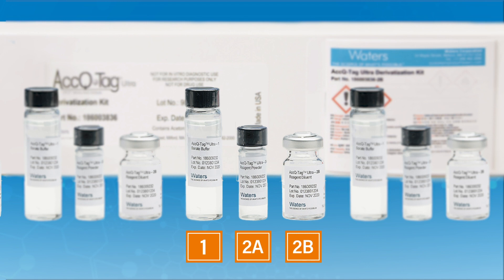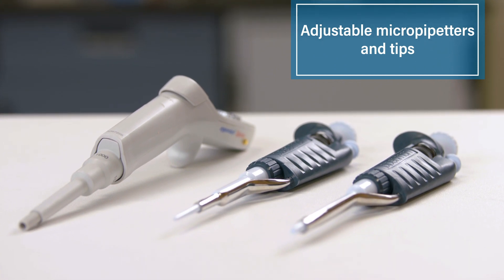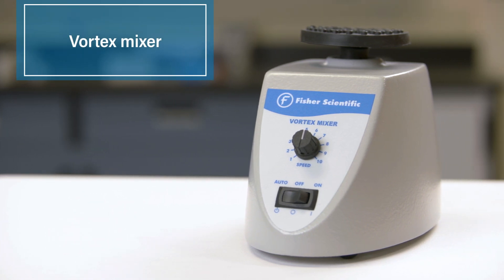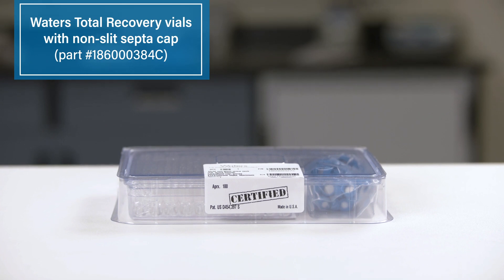Next, make sure you have the required equipment including adjustable micropipetters and tips. We recommend calibrated pipettes, a vortex mixer, and Waters total recovery vials with non-slit septa cap.